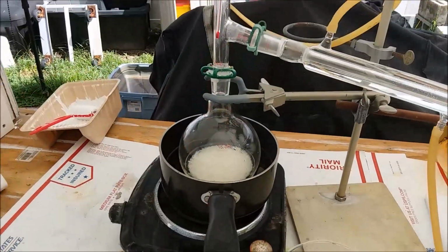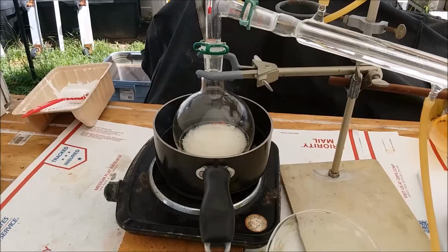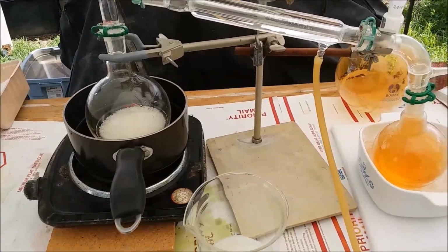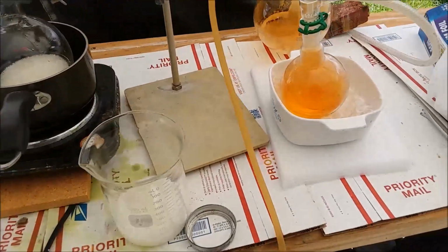And there's a lot less material in there that needs to be dissolved. Anyway, I'm going to put foil back on this and let the second distillation go. And then once it's done, I'll disassemble it and clean it, and we'll look at our yield of nitric acid.